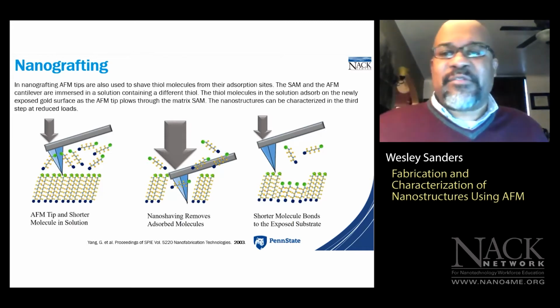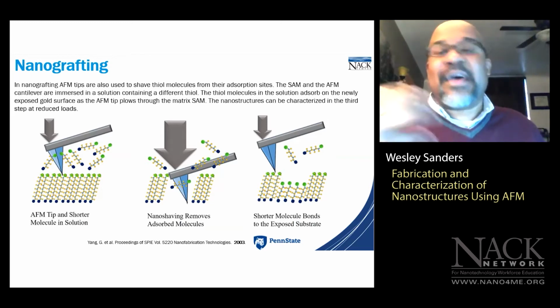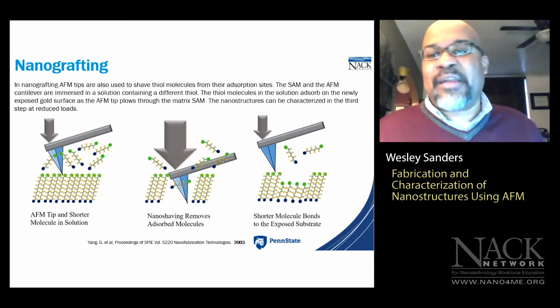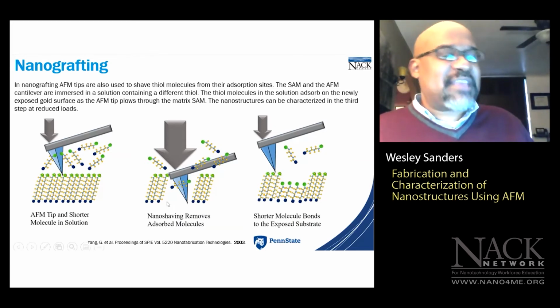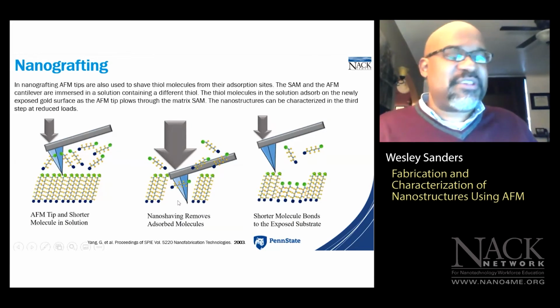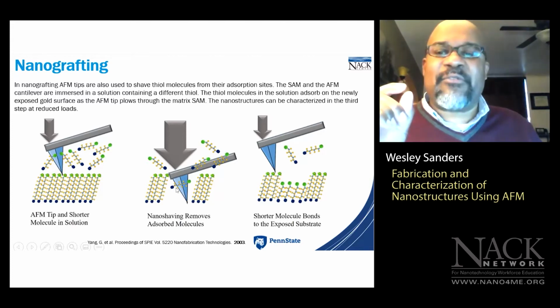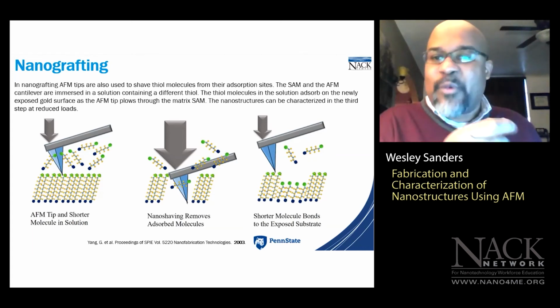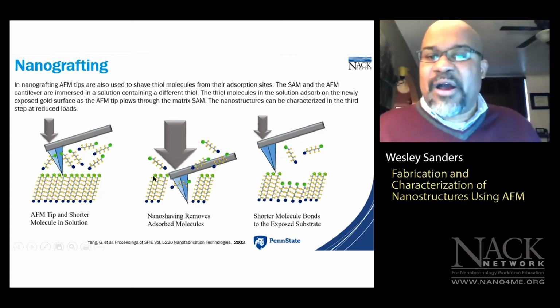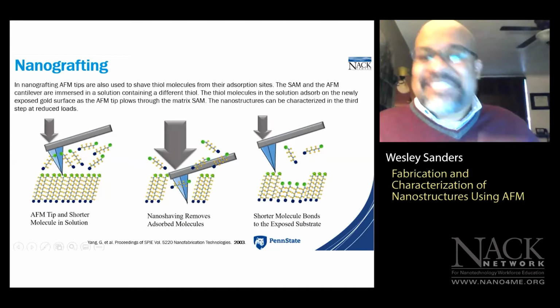And then you have 3 other spots that can test for a different biological molecule in a small volume of sample. So what you can do in this case is etch away a particular region in your methyl terminated self-assembled monolayer and backfill it with different alkane thiols, each with a different head group. And the different head groups will allow those particular squares or circles to sense a different molecule in the sample.